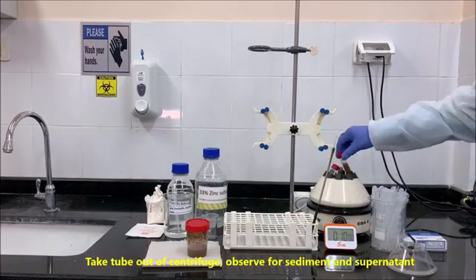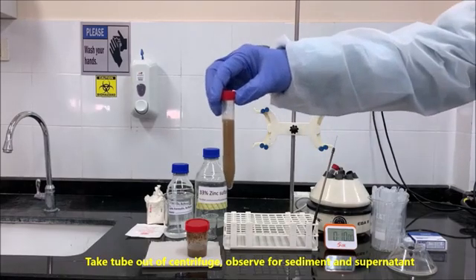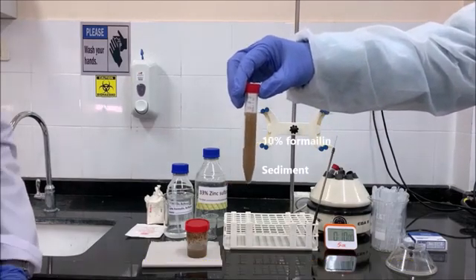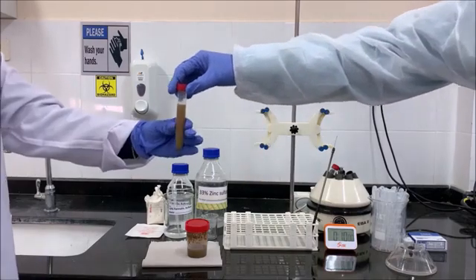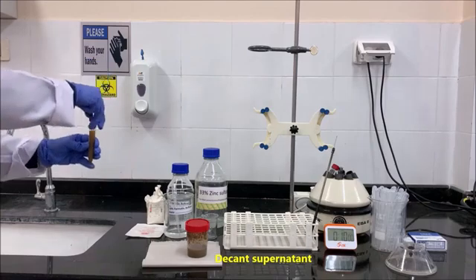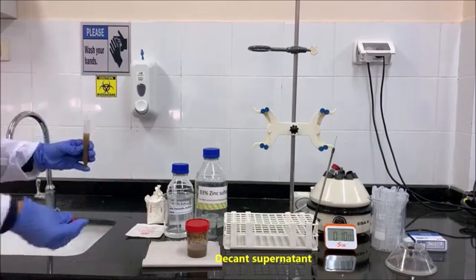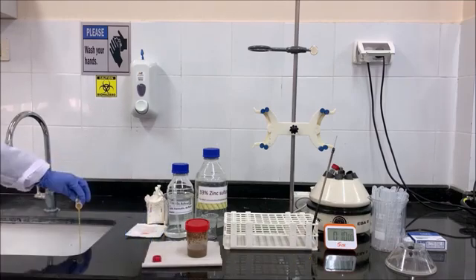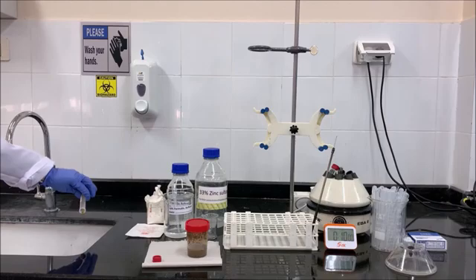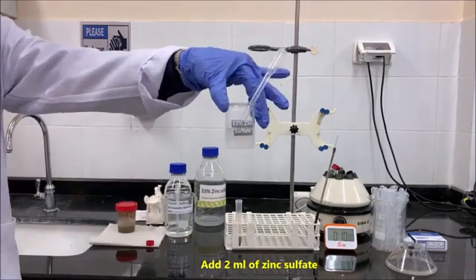Take tube out of centrifuge, observe for sediment and supernatant. Decant supernatant. Add 2 ml of zinc sulfate.